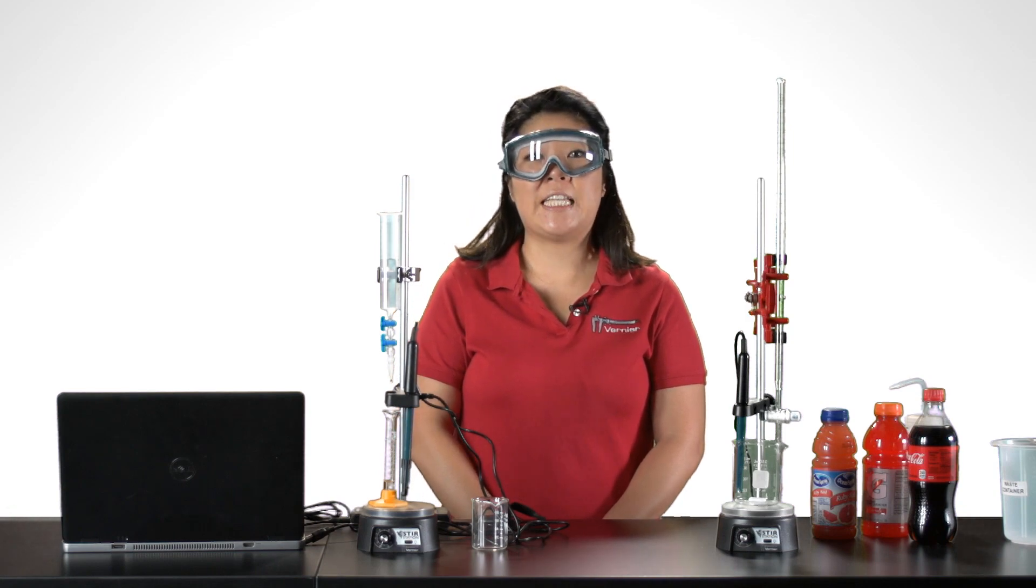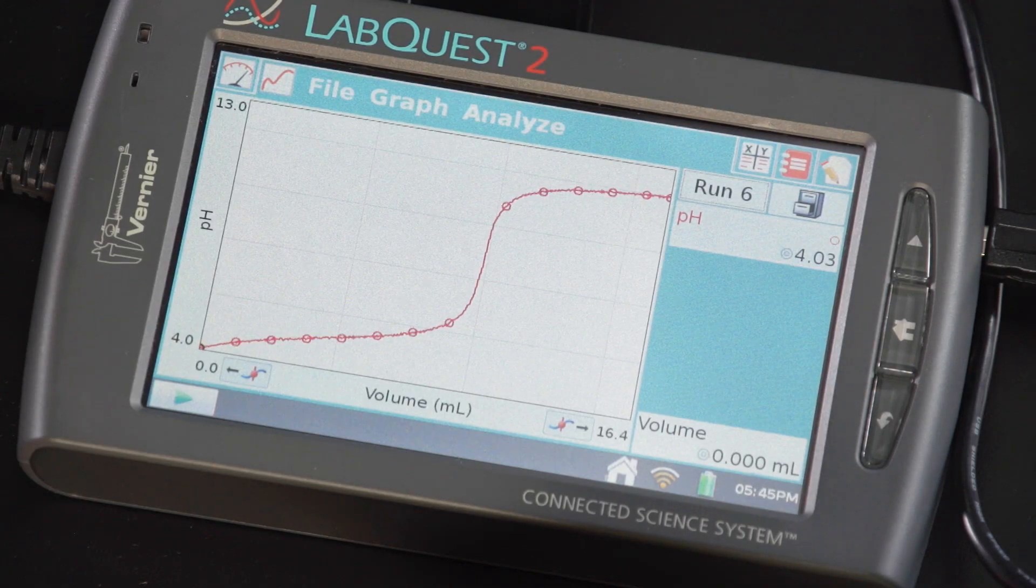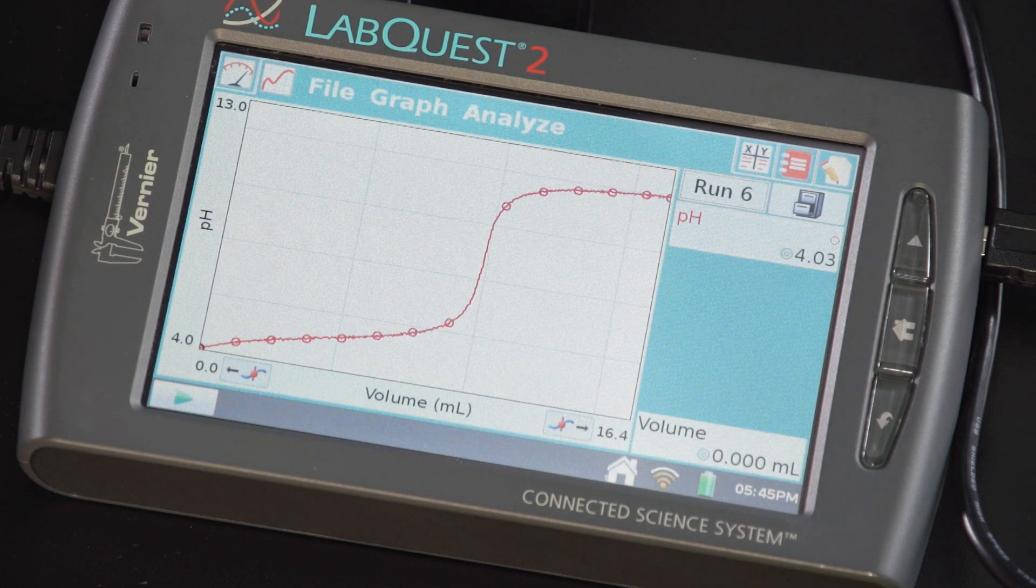Once the investigation is completed, this graph is representative of an acid-base titration. The sample data was collected using Gatorade.